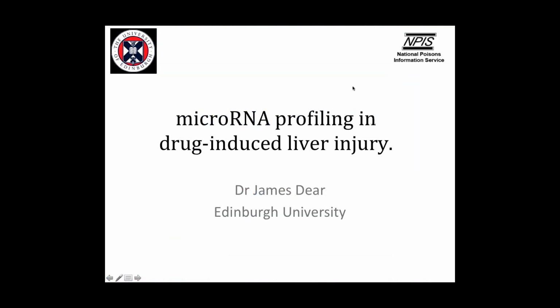So as you said, I'm going to give, in the next 25 or so minutes, an overview of how we've used the QIAGEN miScript platform to discover microRNA biomarkers for drug-induced liver injury.